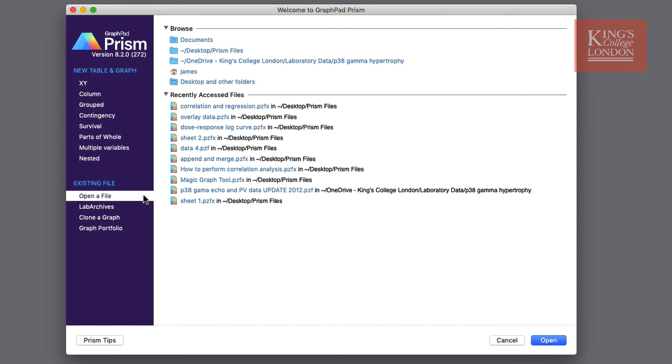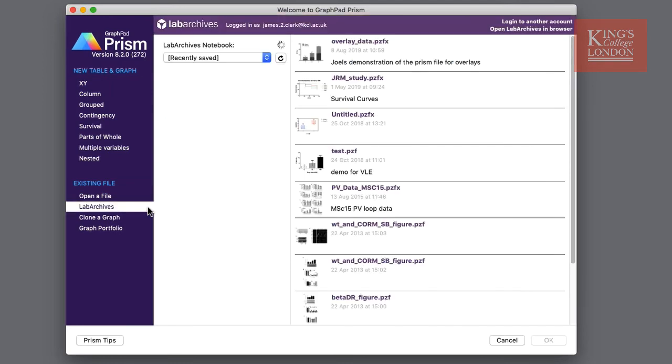Many GraphPad Prism users already take advantage of the Lab Archives service. Lab Archives allows you to store your data, your graphs and your tables in an online resource where you can then share with collaborators or store for later use. If you are a Lab Archives user and wish to use this you can click on Lab Archives and access your online resources.